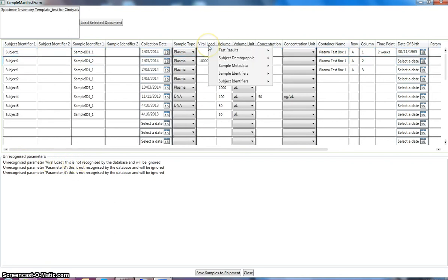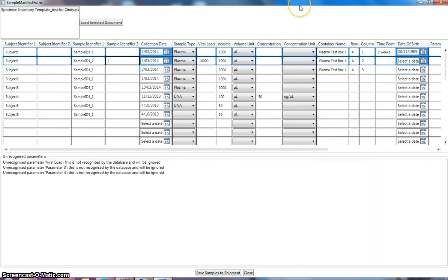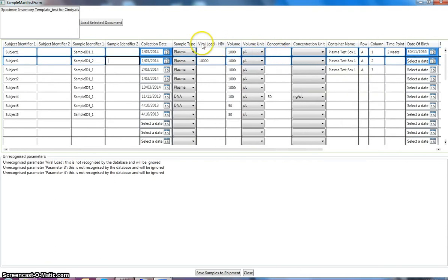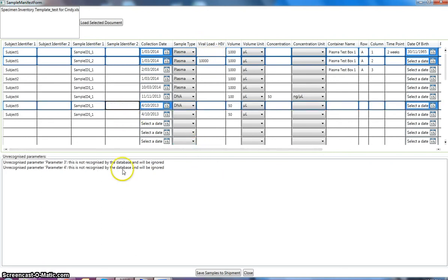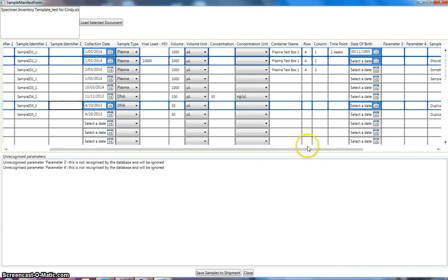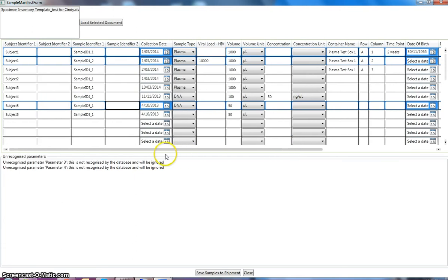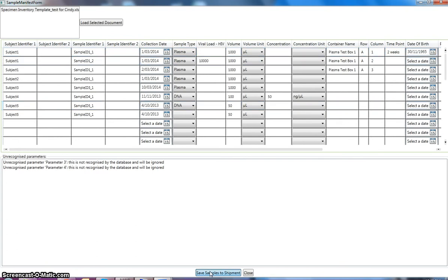So if we right click on viral load, that comes under test results. So we can select the relevant field there. And click onto another cell. And now we've got parameter three and parameter four, where it's telling us it's not recognized by the database and will be ignored. That's fine, because we haven't actually put anything into parameter three and parameter four. So at this point, we can save these samples to the shipment.